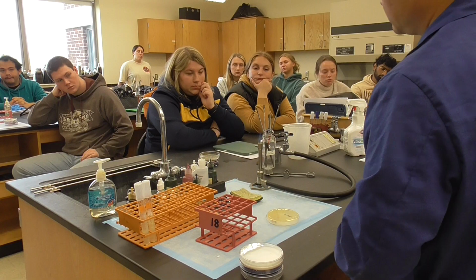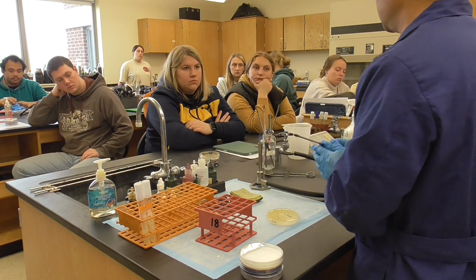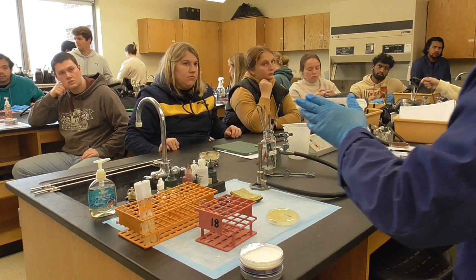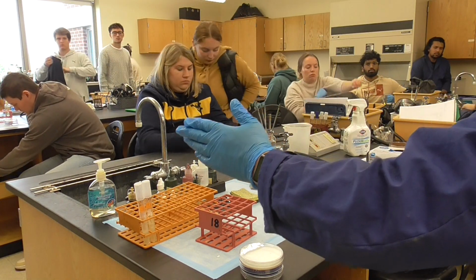And then give it to the TA. We'll do the incubation for you, and we'll see it next week. I hope by the time you see a very transparent zone, but no contamination. If you have cross contamination, next week Tuesday it looks horrible. It will be everywhere.